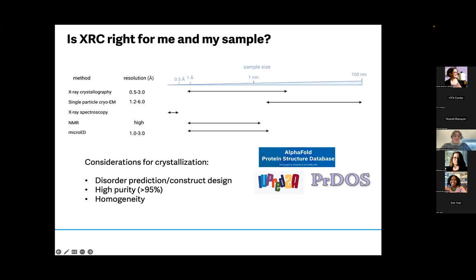And then our best behaved proteins that we see at the center are homogeneous. And so typically our users will assay this by gel filtration or dynamic light scattering to assess what sort of protein populations they have in the tube. It's also very important to make sure your protein is in a stabilizing buffer when you send it to us. So for example, I used to work with a lot of nuclear proteins and they tended to prefer a higher salt buffer.